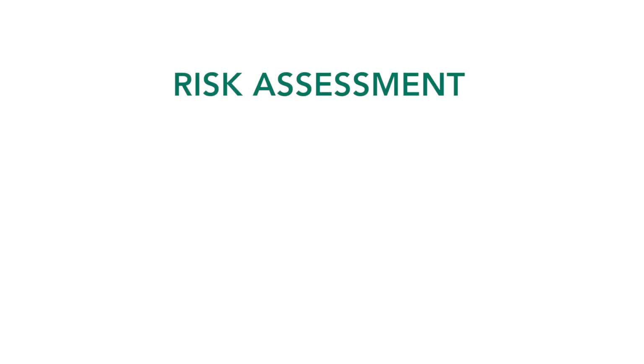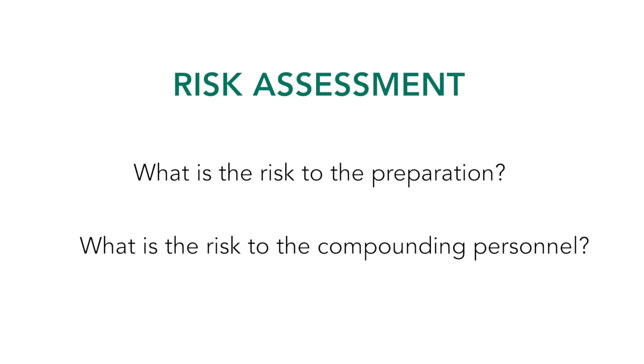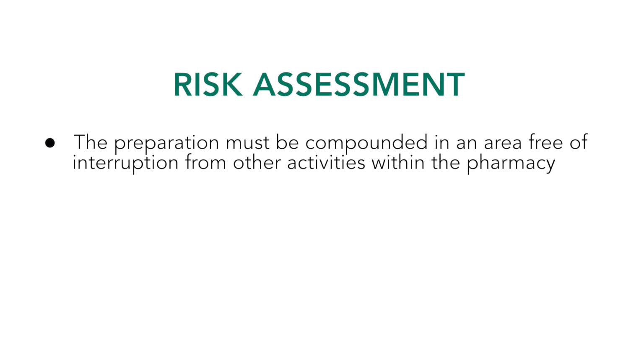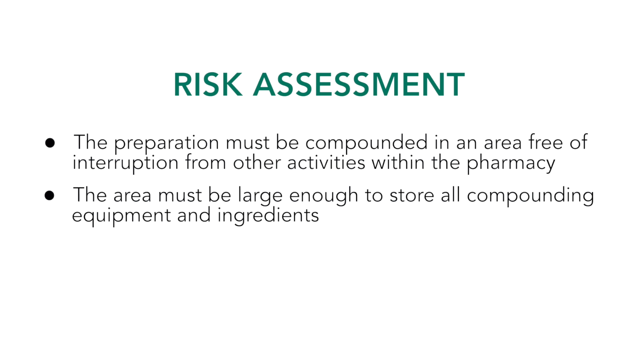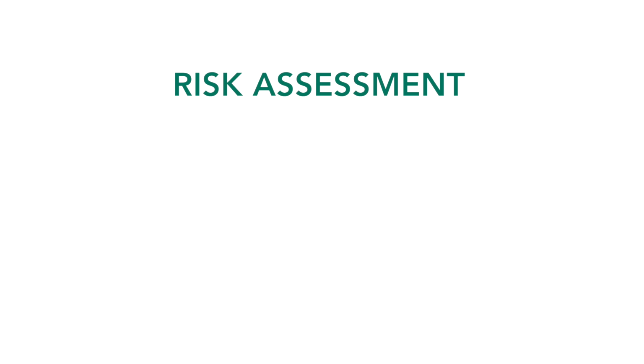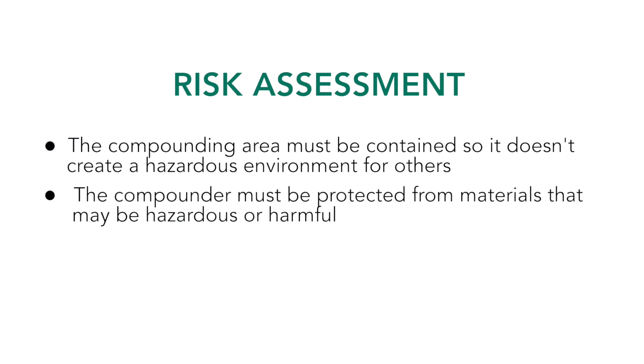When conducting a risk assessment, you want to consider what is the risk to the preparation and what is the risk to the compounding personnel. The preparation must be compounded in an area free of interruption from other activities within the pharmacy. The area must be large enough to store all compounding equipment and ingredients. The compounder must ensure that nothing in the surrounding area contaminates the preparation being compounded. The compounding area must be contained so that it does not create a hazardous environment for others. The compounder must be protected from materials that may be hazardous or harmful.